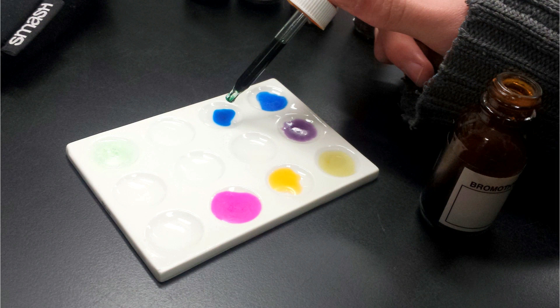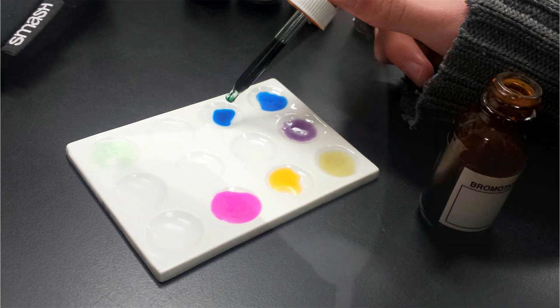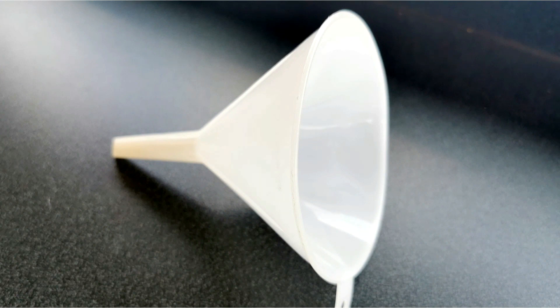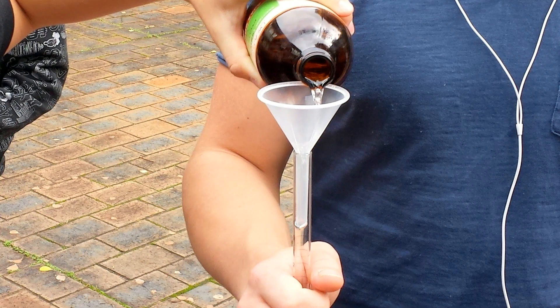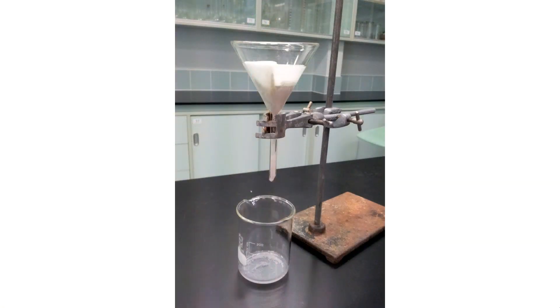This is a less gross use of a spotting tile — just testing different acid-base indicators. No guesses for this one surely — it is of course a funnel, used for either pouring without making a mess or doing filtration by putting some filter paper in it and filtering something through.